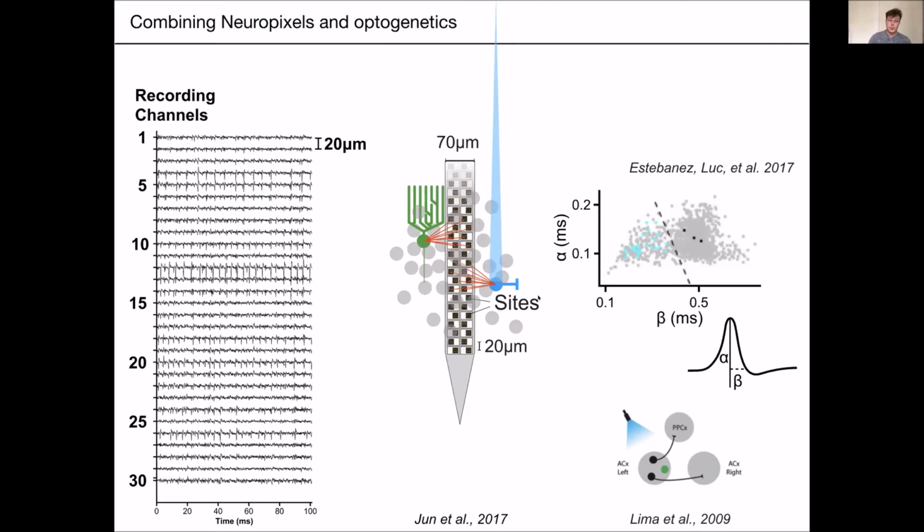And this is only one of the ways you can use optogenetics. This is something we do in the lab, but of course, you can use optogenetics for many other reasons. As soon as you want to go beyond correlational evidence and you want to causally perturb your system, you will have to make your neurons fire in a way. And also when you do imaging, you also shine light on the brain and you will have to deal with artifacts.